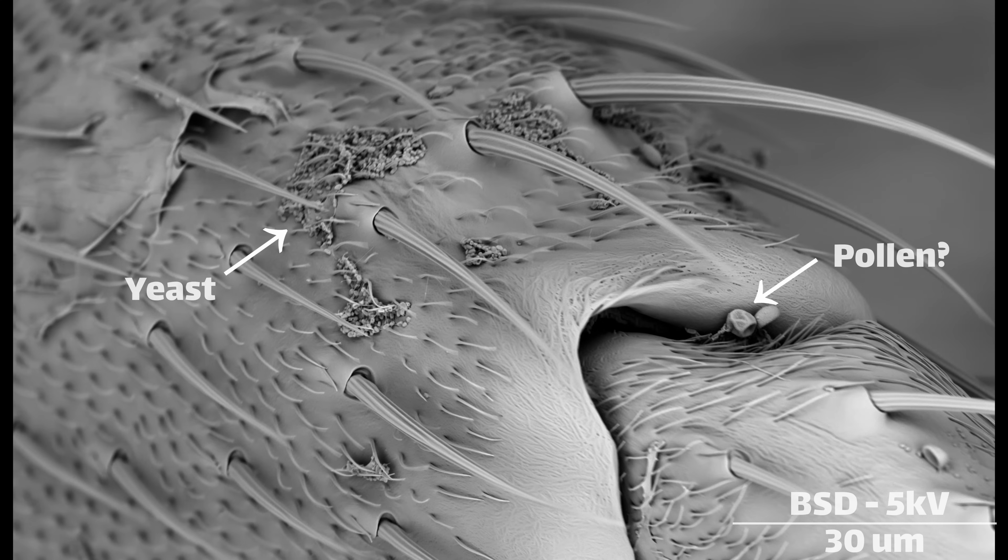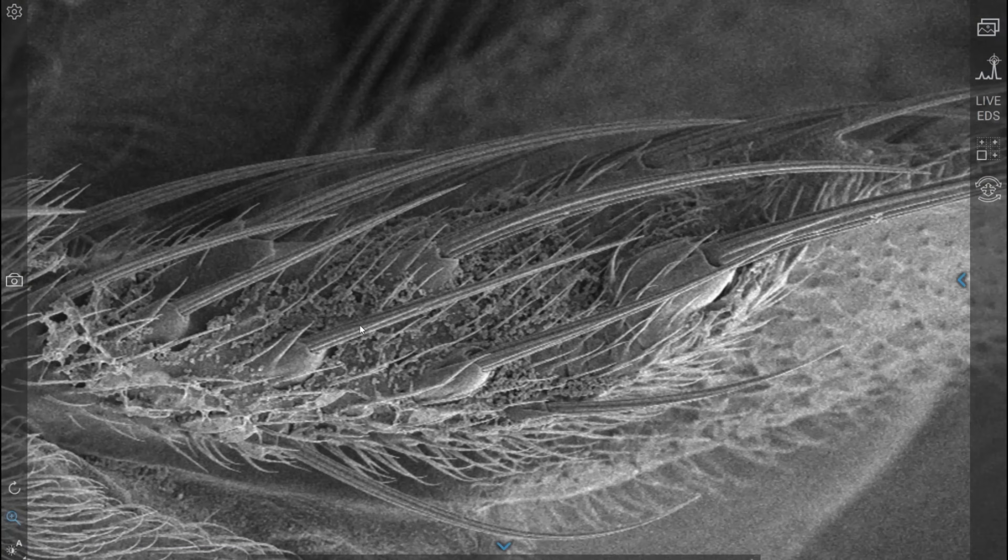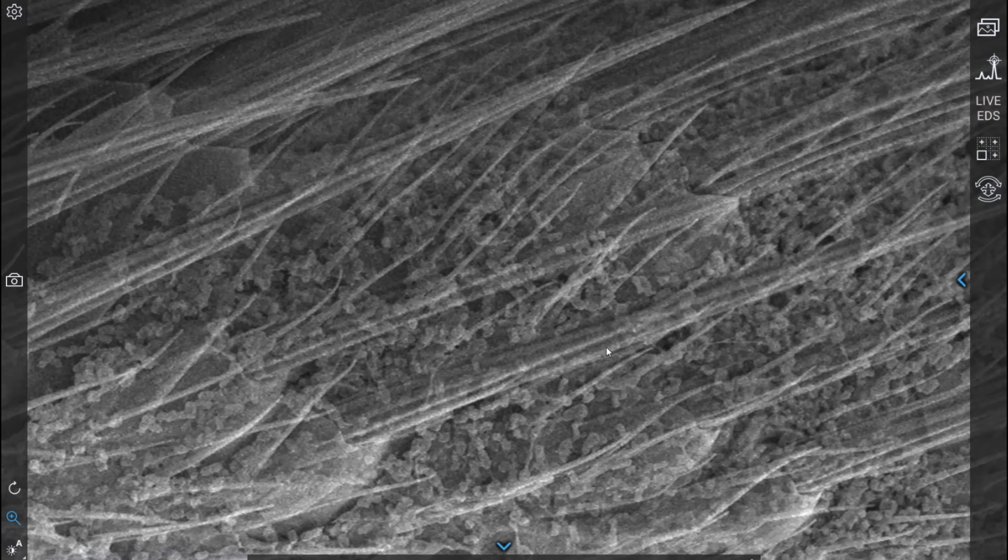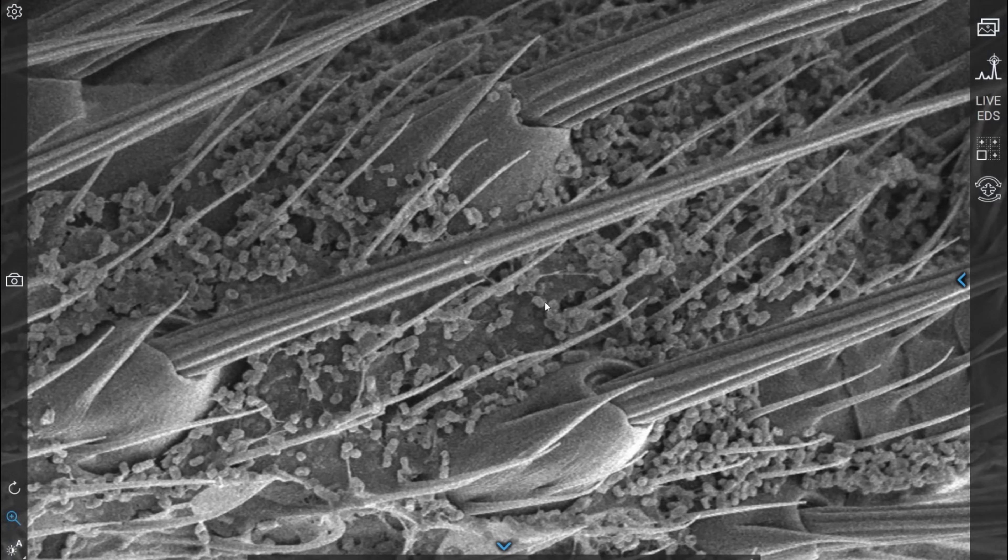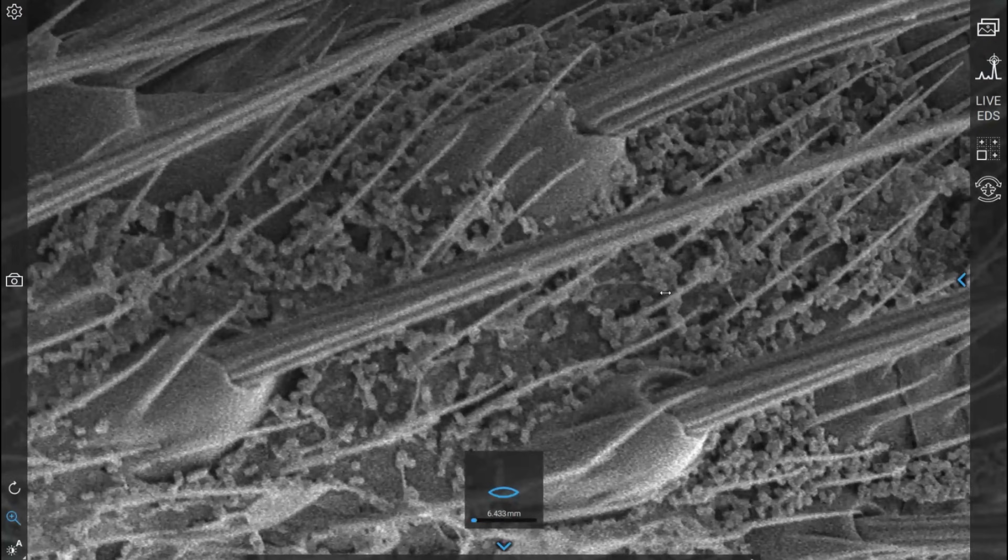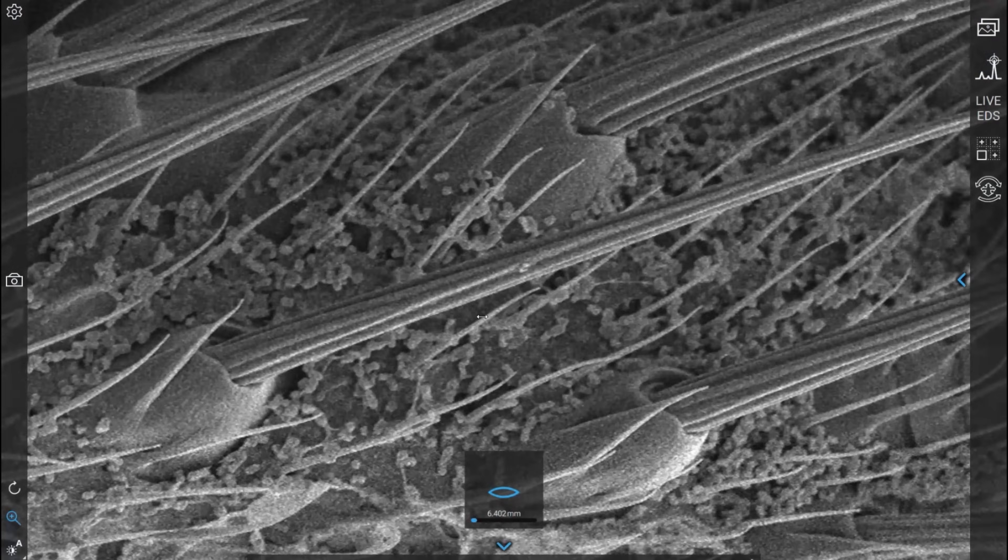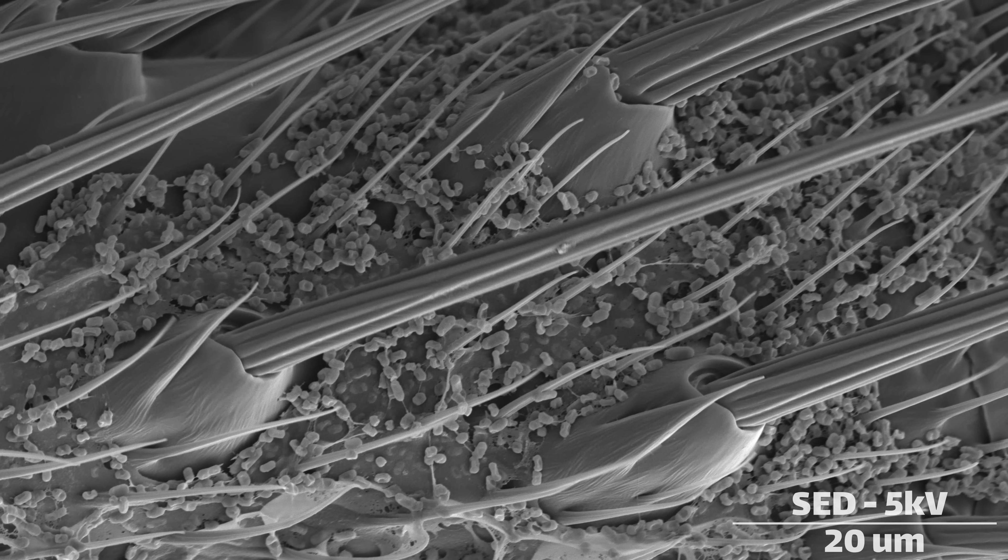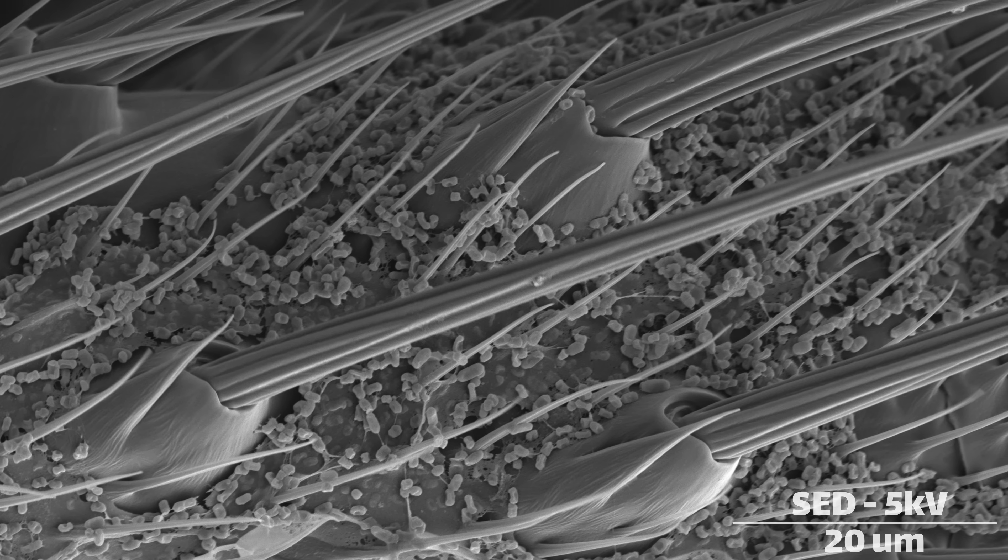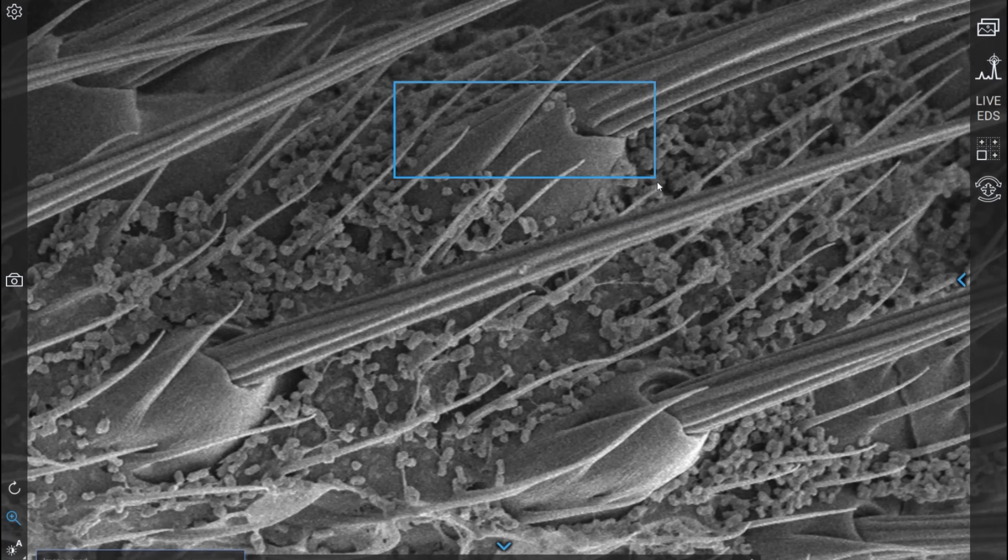As I mentioned before, Drosophila feed on yeast and climb around surfaces that are covered in yeast, so it's not unreasonable to expect that some of those yeast cells would hitch a ride on the fly itself. We can see various locations around the fly that likely contain yeast cells tucked away behind joints and around hair follicles.